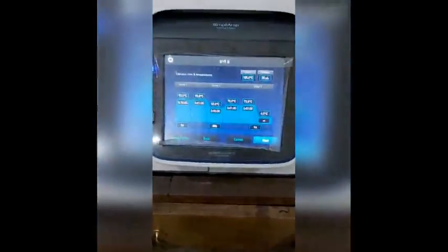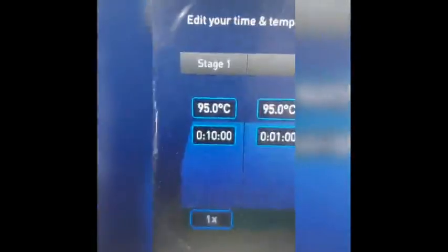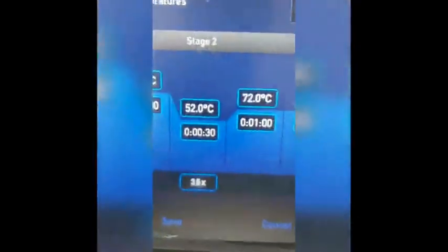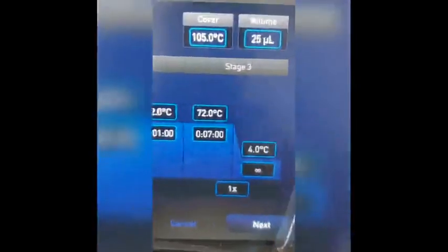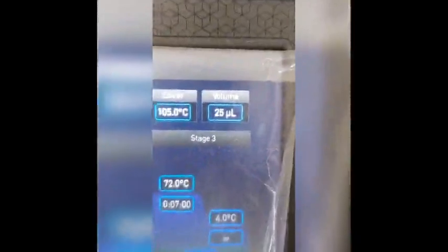Looking at the saved program — the gyrASB program — the information shown on the screen includes three stages. Stage 1: initial denaturation at 95°C for 10 minutes. Stage 2: denaturation for 1 minute, then annealing at 52°C for 30 seconds, then extension at 72°C for 1 minute. Stage 3: final extension at 72°C for 7 minutes. After the process is complete, the PCR product is stored at 4°C. The total volume is 25 microliters.